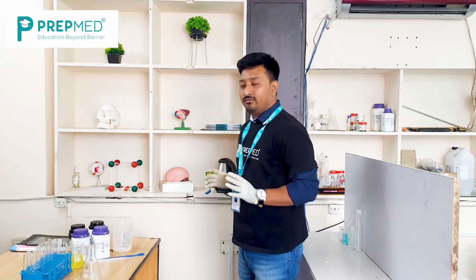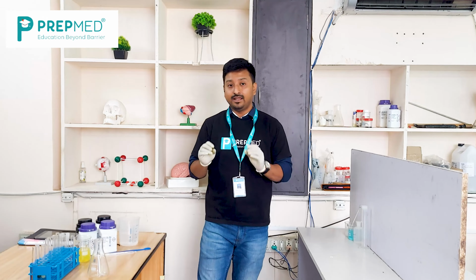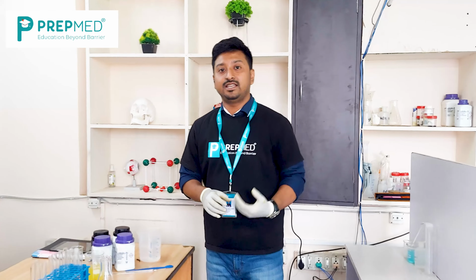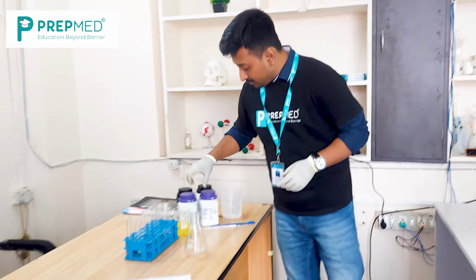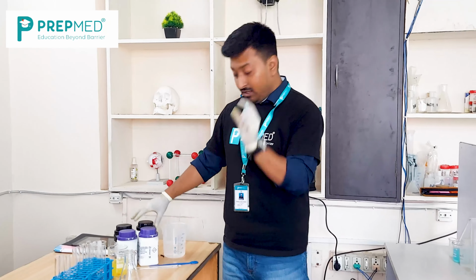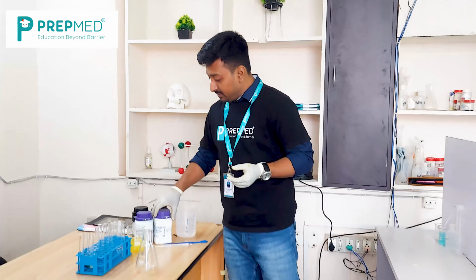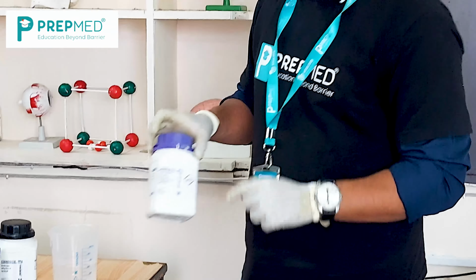So now we are going to have an experiment where I will show you that KMnO4, which is one of the great oxidizing agents, how that actually changes color in presence of a reducing agent in alkaline medium. In order to do that, what we definitely need is potassium permanganate, and as a reducing agent we need the dextrose solution, which is glucose, and to maintain the alkalinity of the medium we need sodium hydroxide.